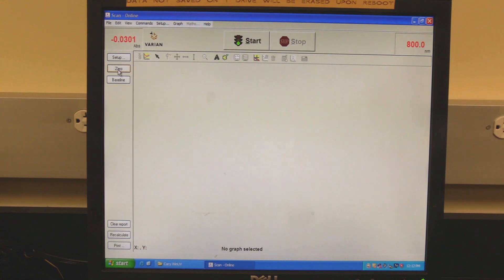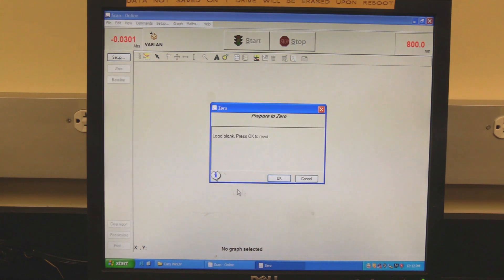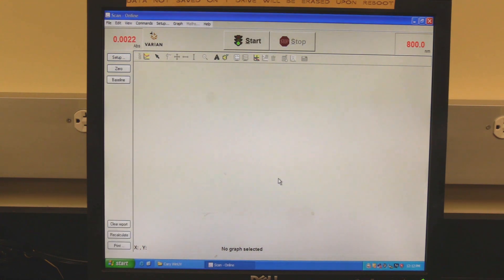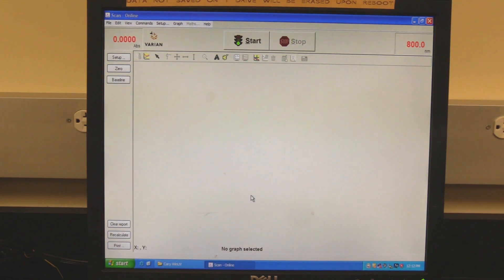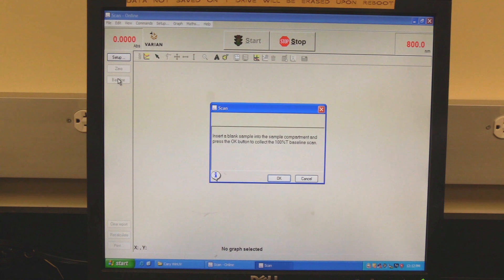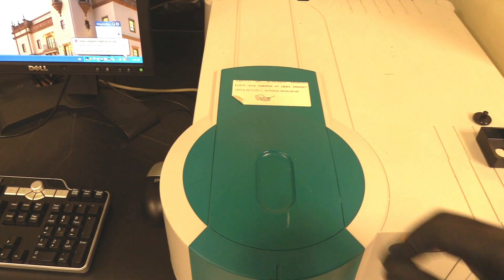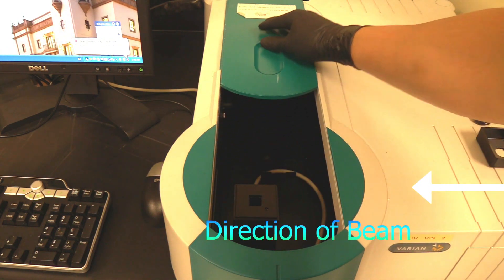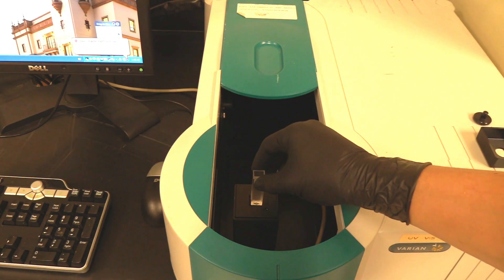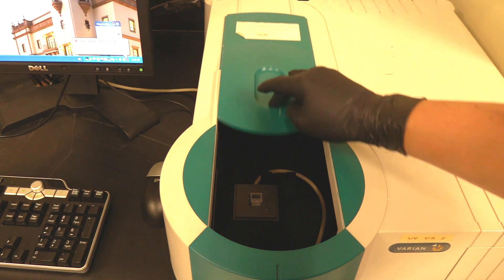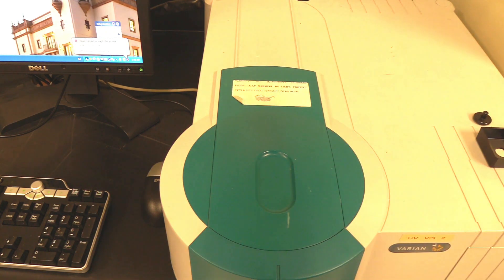Click on the zero button. When prompted, click on OK. In some cases, the instrument may need to be zeroed twice. Click on the baseline button. The software will prompt for the operator to insert the blank cuvette. Slide open the sample chamber lid, insert the blank cuvette, and close the lid. Be mindful that the beam path is right to left. Insert the cuvette so the clear sides are aligned with the beam direction.